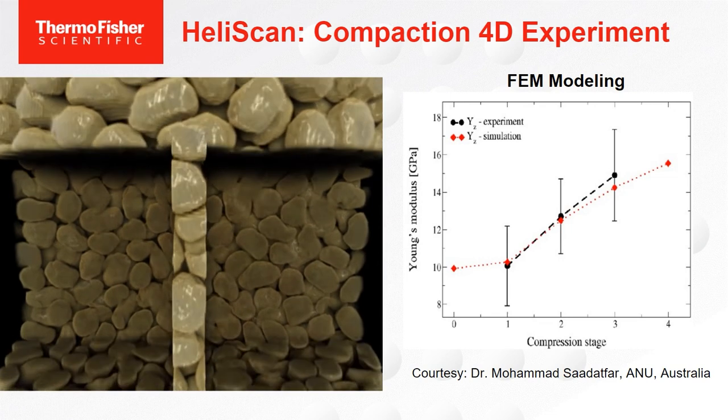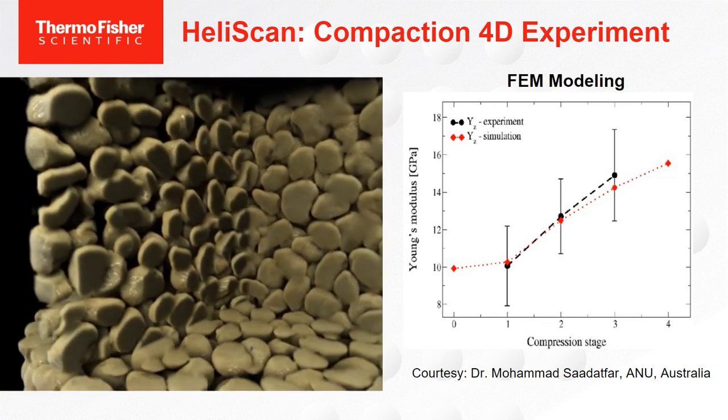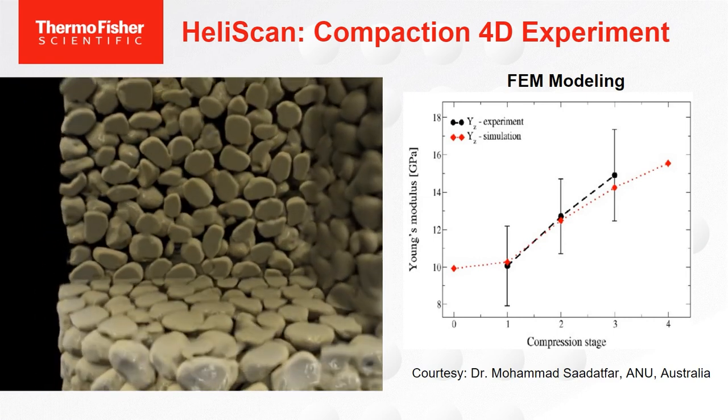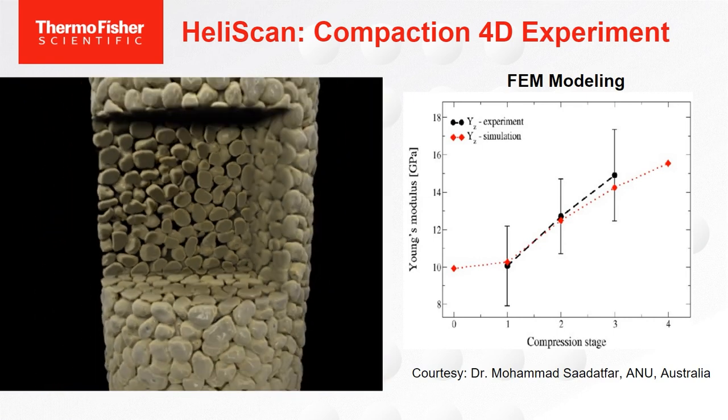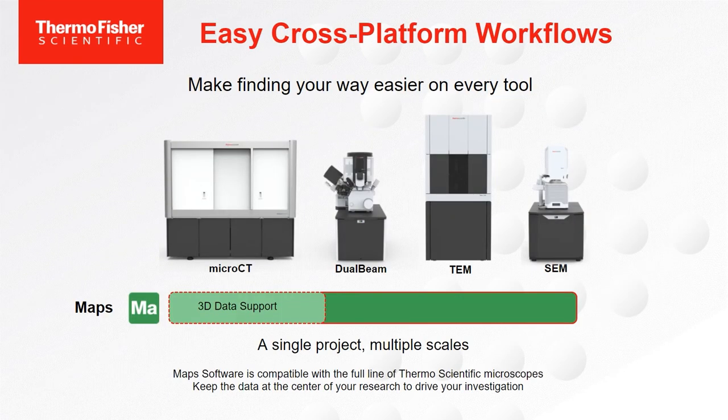So you can begin to ask and answer the questions: where are the failures in my structures originating? And of course, the 3D non-invasive power of this technology is what allows those types of experiments to happen. So that's a fantastic state-of-the-art utilization of your 3D MicroCT.